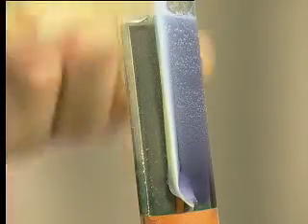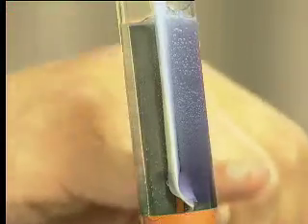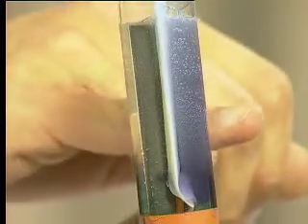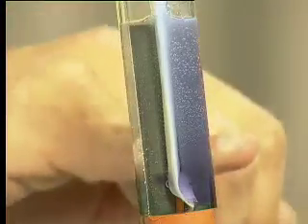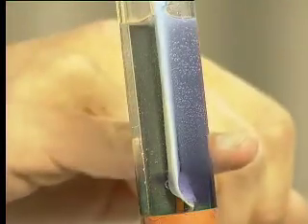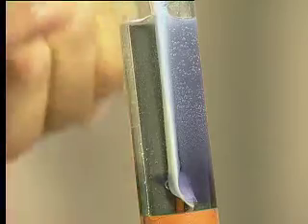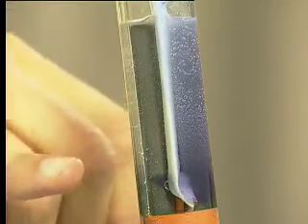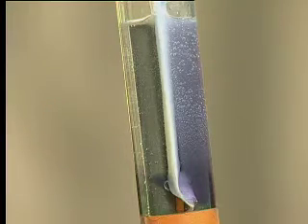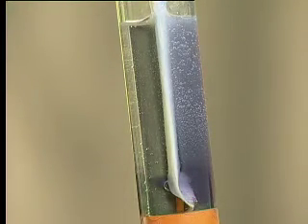Fantastic, showing that we've got blue on the one side, meaning that we've got sodium hydroxide produced at our negative electrode. Remember, on the right of your screen we've got the negative electrode, so that's blue and sodium hydroxide, and the gas produced is hydrogen. On the other side, I've got my chlorine gas, produced at the positive electrode. So the anode is on the left side of your screen, the cathode on the right. I hope you can see that's demonstrated very nicely, where the products are being produced.